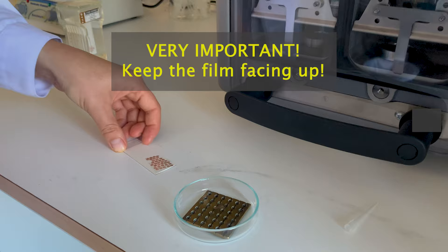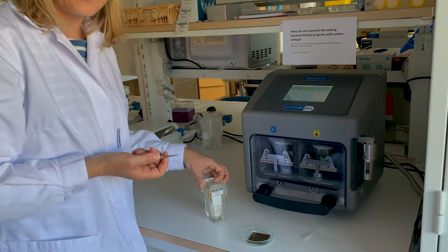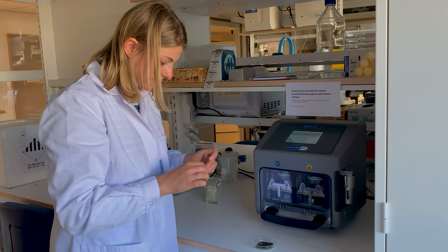I place it with the film facing up — this is very important, because this is the side that we want to expose to the treatment. I typically do at least two replicate grids per sample, because you never know if one can turn out better than the other. It's always good to have a replicate — in case anything looks weird you can always double check on the second grid.